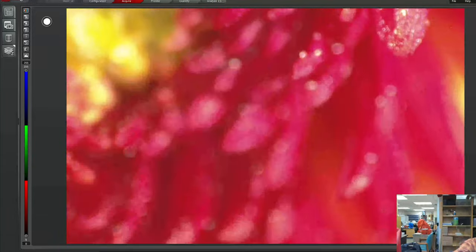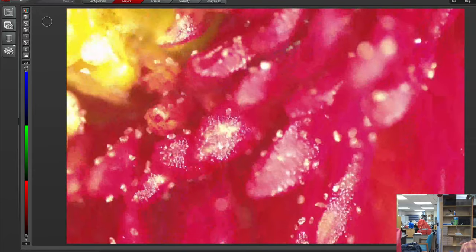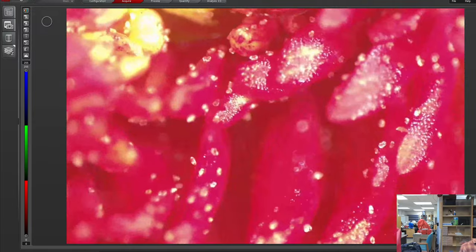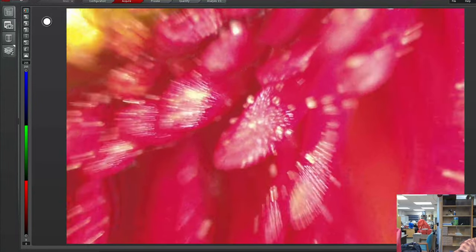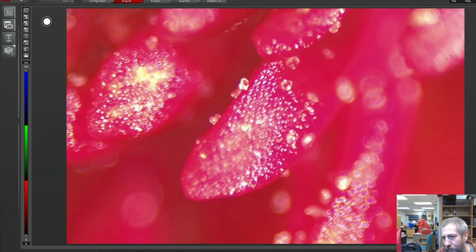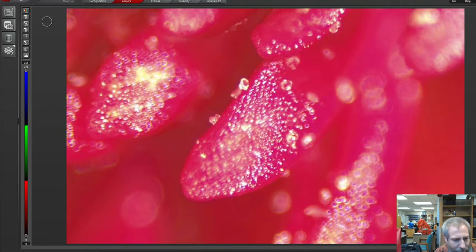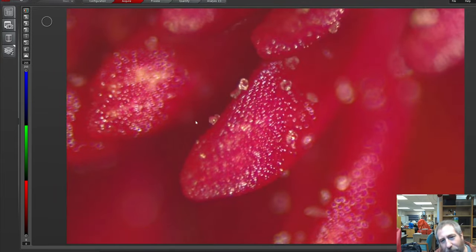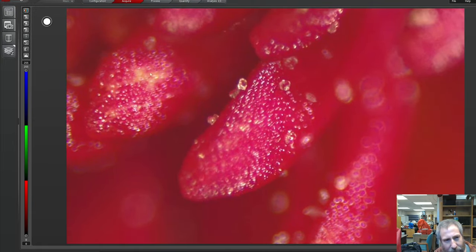Let's go take a look at them, see if we can find it. Yes. So the surfaces look like they're wet or something, but I think those are actually the pollen grains themselves. I was hoping we'd be able to see some of this. Some little bits of pollen. That's super red. I don't know if I can keep trying to click on this. A bit better, not so glary, but you can see the pollen grains that are attached to it.